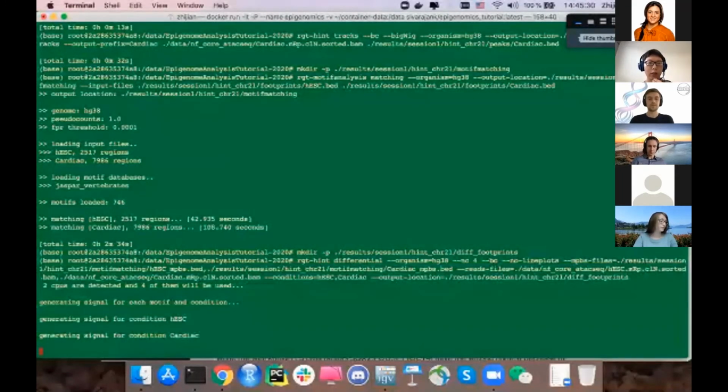Since now we only use chromosome 21, we also provide the completed results using all chromosomes in your data.